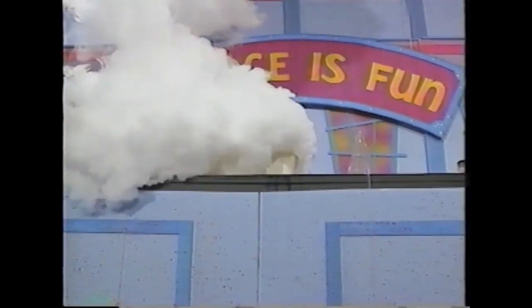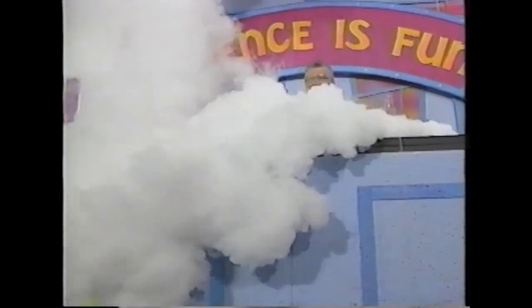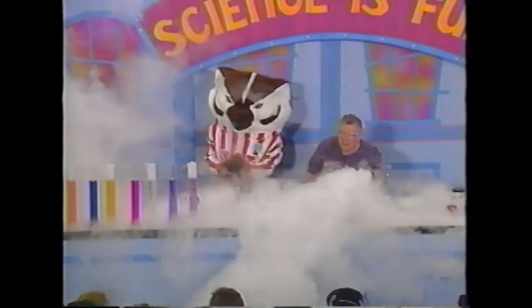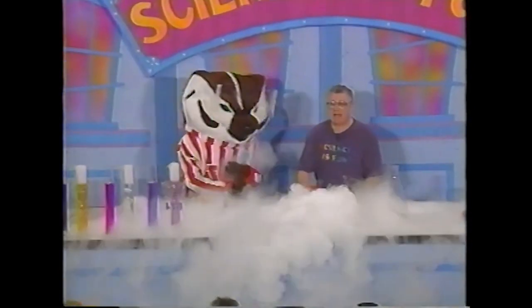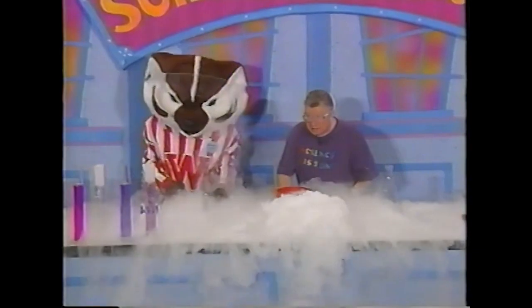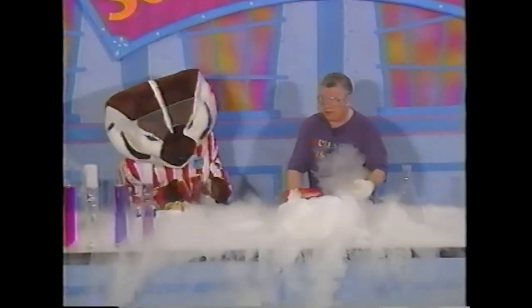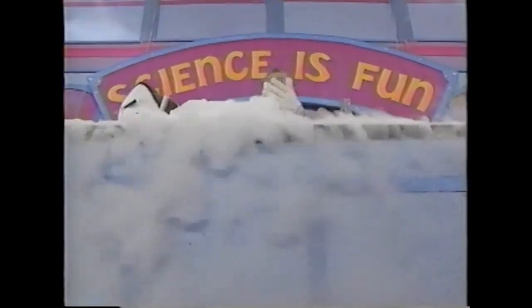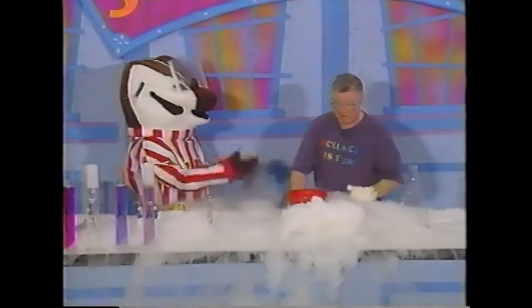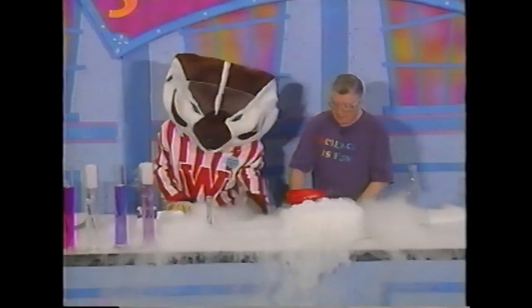Whoa! This is how they make fog in the movies sometimes. They take hot boiling water and add dry ice to it. And you notice that the fog is moving downward because carbon dioxide gas is denser or heavier than air. So this is a pretty exciting experiment.